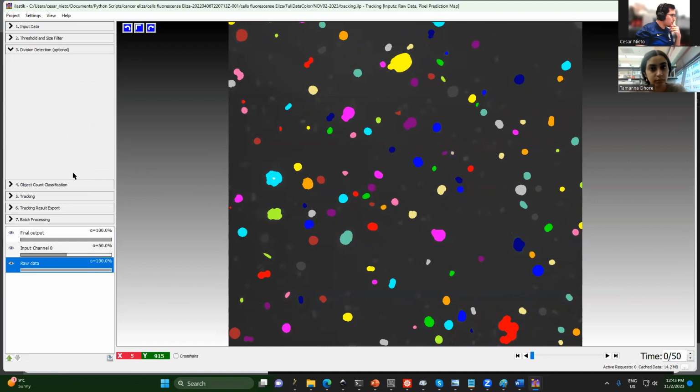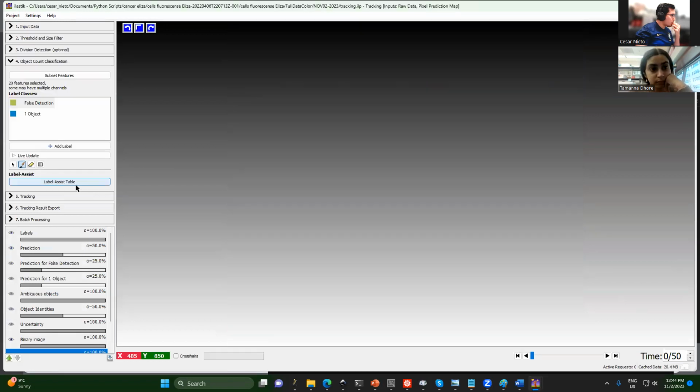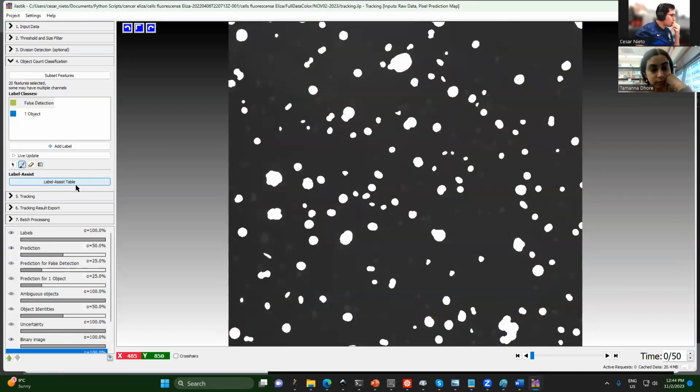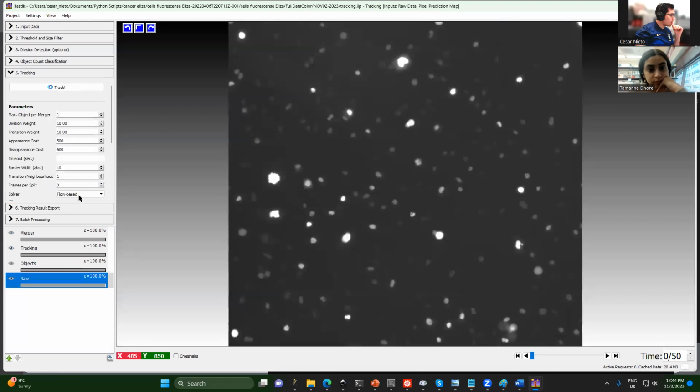This division detection, I'm not sure how it works. Oh, okay, here you can filter manually if your detection was false, I think. And tracking.